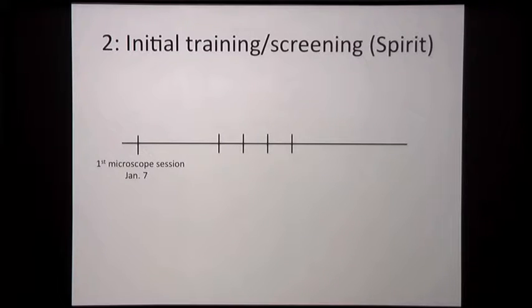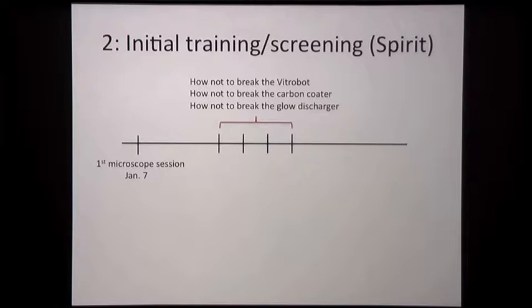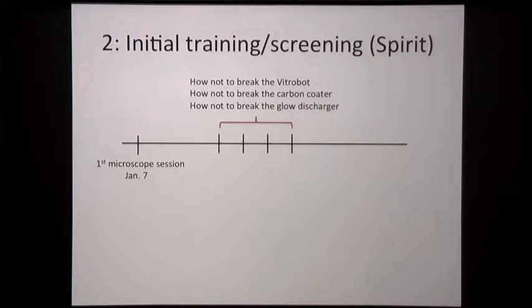And at that point, we spent some time actually learning to make cryo-EM samples. I think one of the things I didn't appreciate before starting this project is how many different components actually go into making a sample for cryo-EM. So you've heard several times from Lori and Christos. You have your grid, maybe you want to put carbon on it, which has to be made. You have to glow discharge the grid, you have to add your sample, you have to freeze the grid.